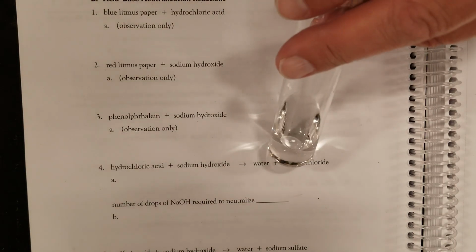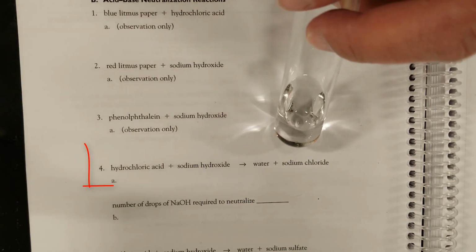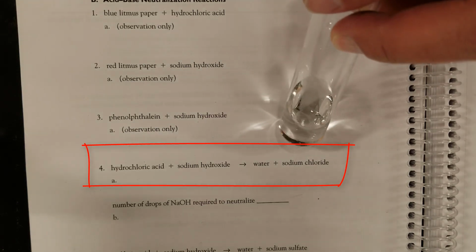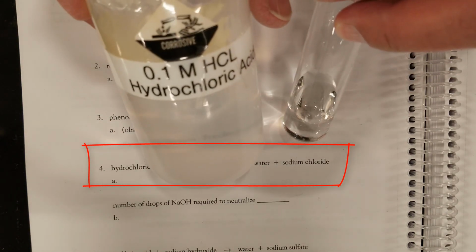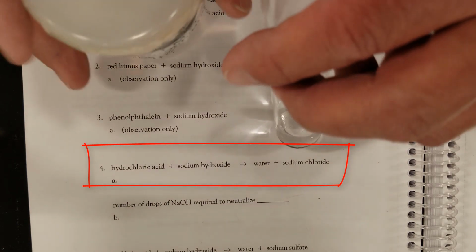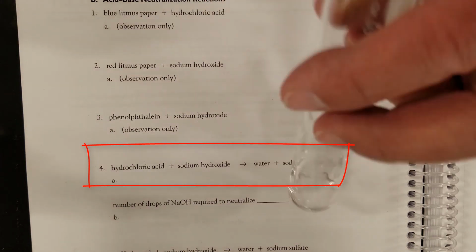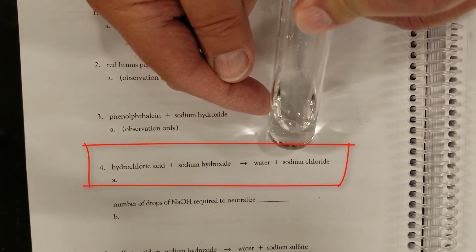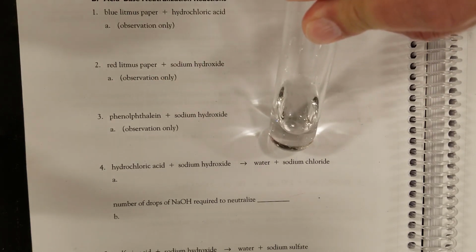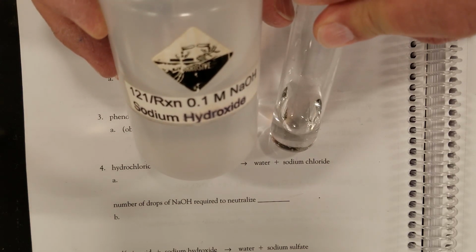Okay, now we've got a tube here with some water. I've added another drop of phenolphthalein, and I'm going to add 5 drops of hydrochloric acid. 1, 2, 3, 4, 5. So I've added 5 drops of hydrochloric acid. So this solution is filled with the acid. Now I'm going to start adding the sodium hydroxide.